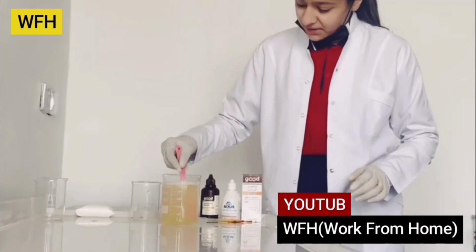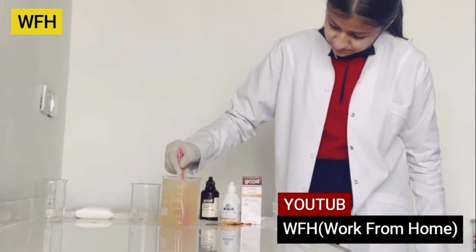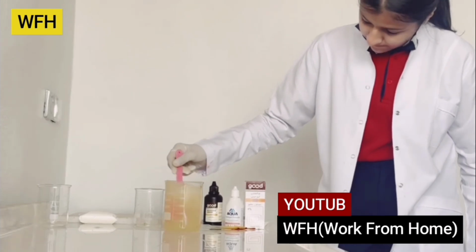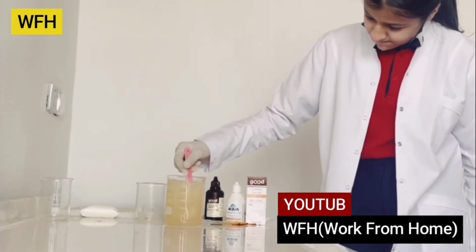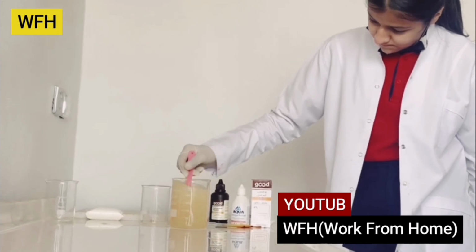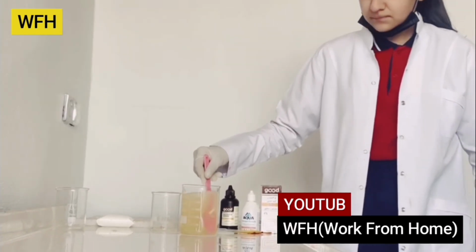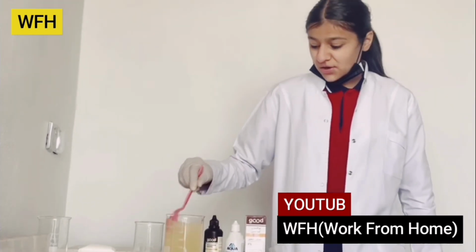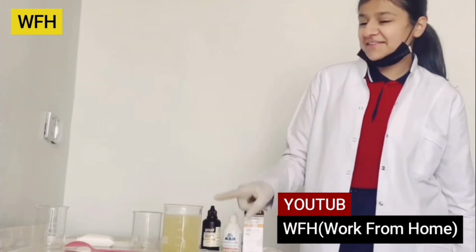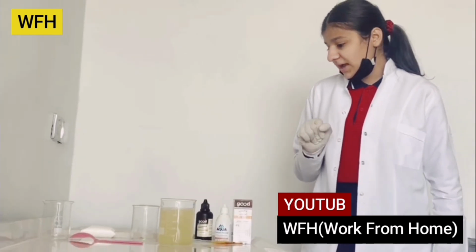So mix it now again. As you can see, the iodine color restores again.